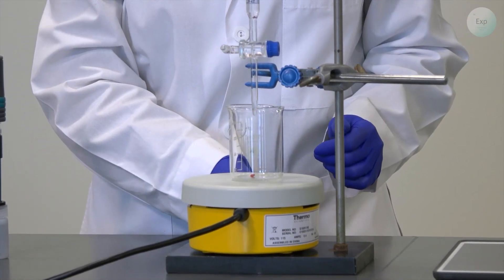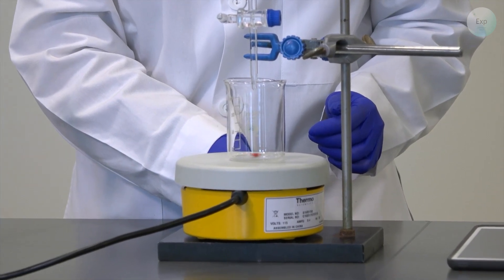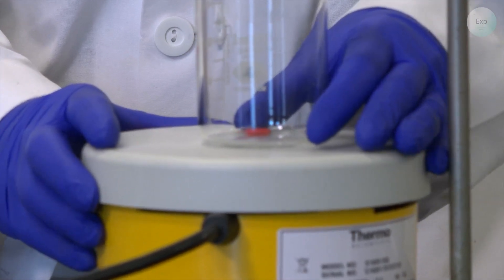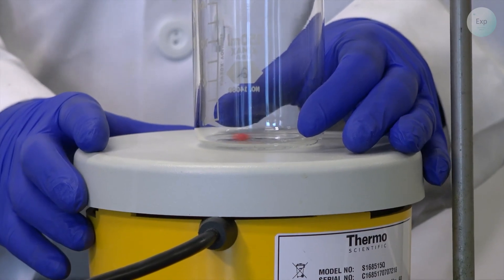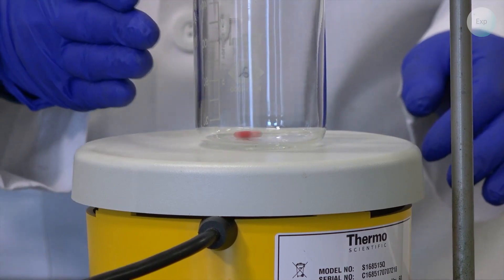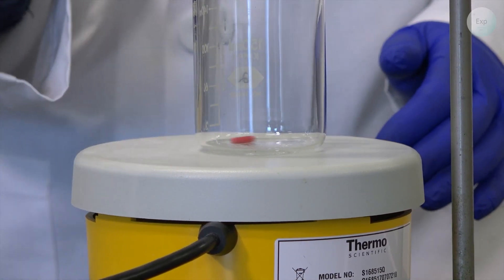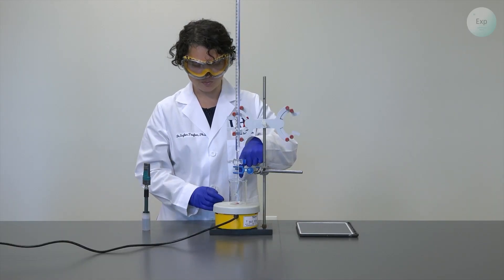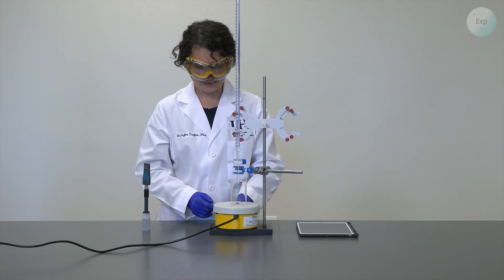It is important to check where the magnetic stir bar is going to move. We want to localize it somewhere in a quadrant of the beaker so that we can position the pH probe away from it. My magnetic stir bar will be between 12 and 3 on the clock dial sides, and that way I will place my pH probe at approximately 7 or 8.